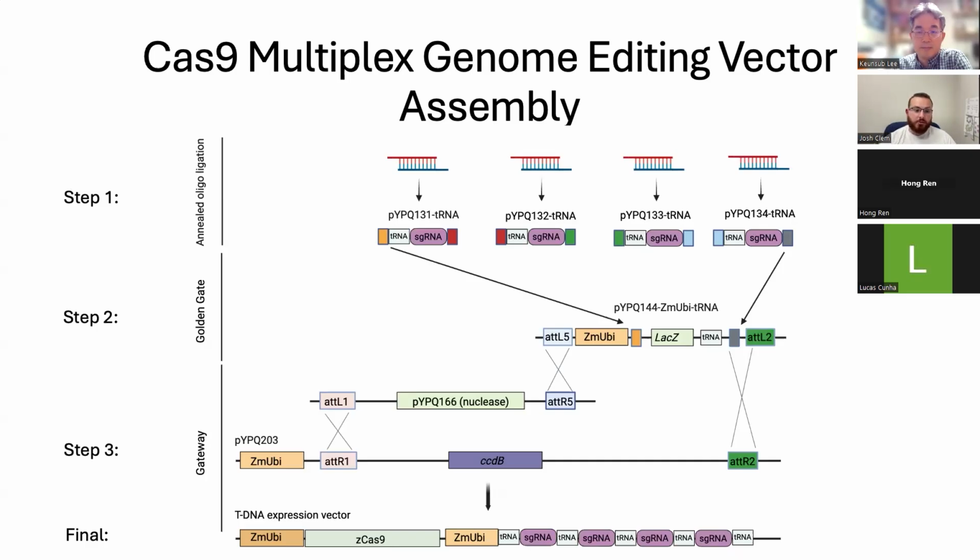Finally, I like to include things that you would also include in primer design, such as a GC clamp. I prefer to have a G or G's and C's at the termini of my guide RNAs, perhaps for better annealing based on the 3 hydrogen bonds between G's and C's, right? So those are a few parameters that I include, and then also off-target sequences, something to consider as well.